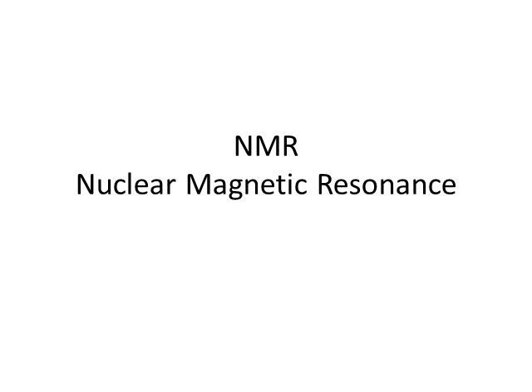In the third section we looked at the basics of proton NMR. That is, we saw how that was similar and different from carbon-13 NMR and how molecules can give rise to proton spectra. If you have not seen those different presentations, I would suggest going back and doing so. But here we're going to do a couple of practice problems. We're going to see how we can solve proton NMR.